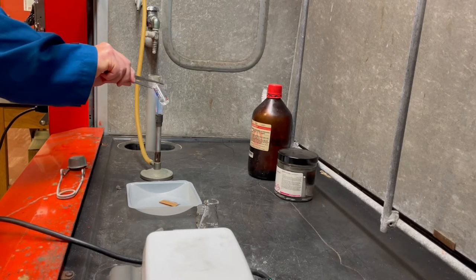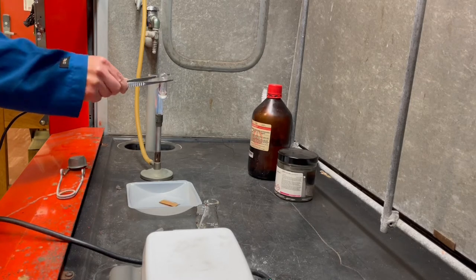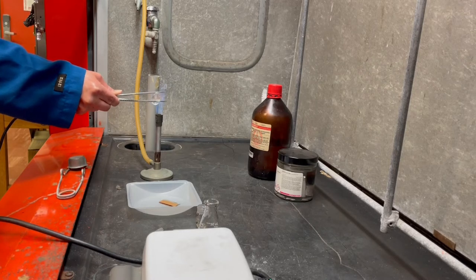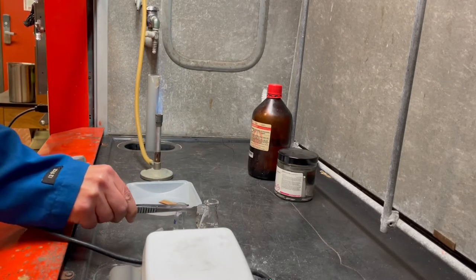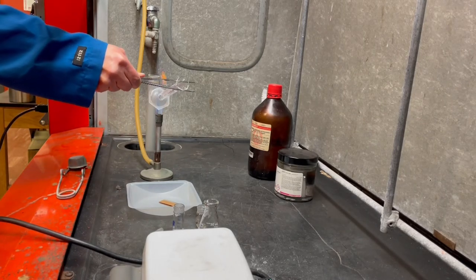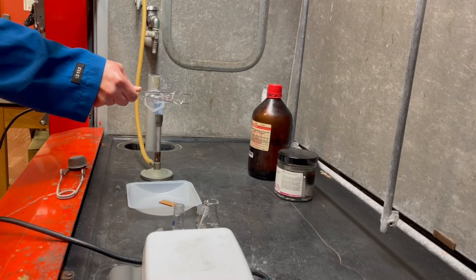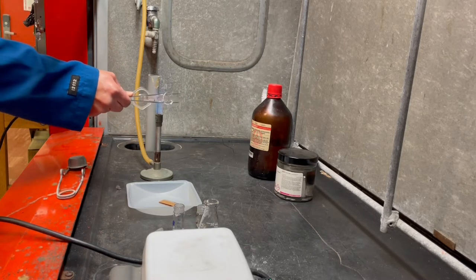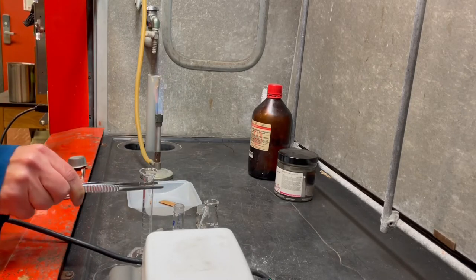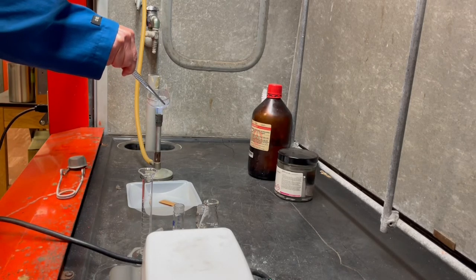So I'm just doing what I can, and that is hitting it with the flame. You'll see there's a ton. I mean, we live by the beach, right? So we are blessed with that, but we also have a lot of humidity going on. So there's a lot of water in the atmosphere, and that can pose a problem when you are doing water sensitive reactions such as this one. And so you'll see when I cut the sodium, it oxidizes pretty quick, so we'll see what happens.